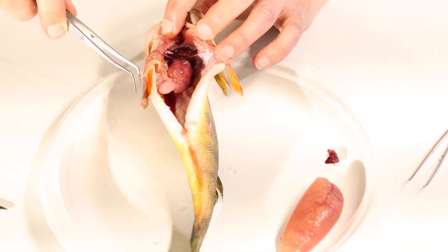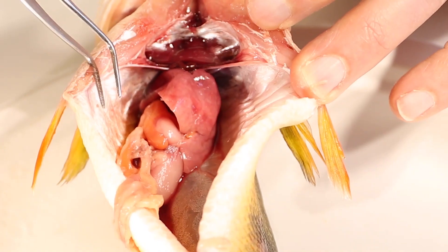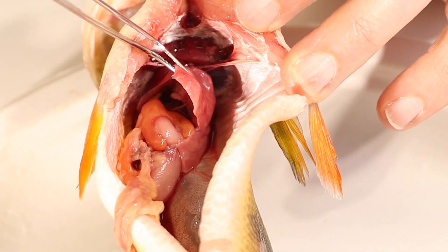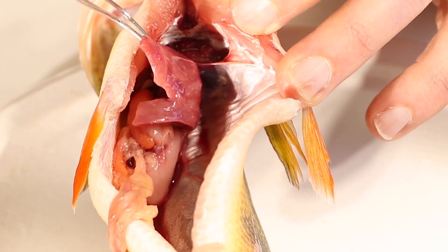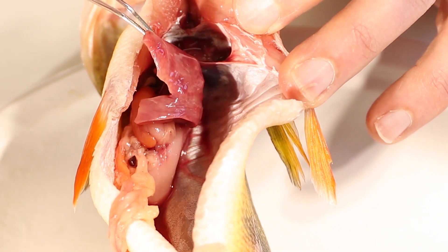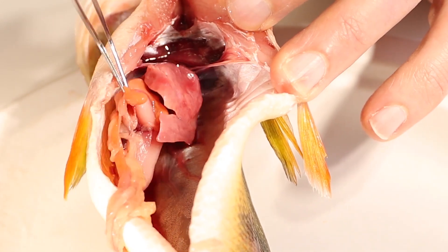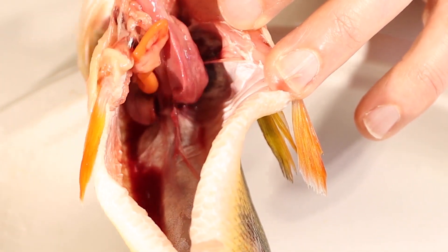Now some of the organs are out, but there are still a few important things left in here — the digestive system, the way food works through the fish. Covering all of the digestive system is this big pink organ — that's the liver. The liver produces fluids called enzymes, and they help the fish digest its food when it's down here in the fish's stomach, which is kind of hidden underneath all of this.